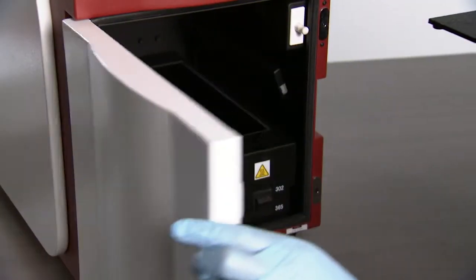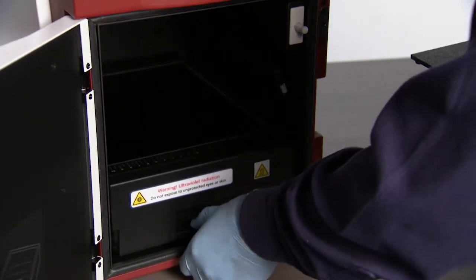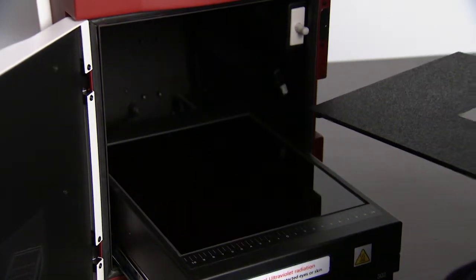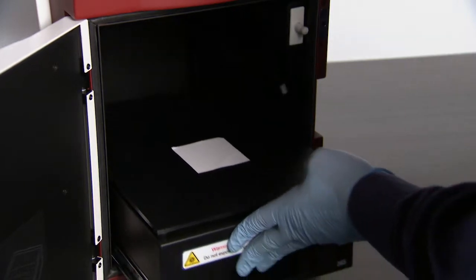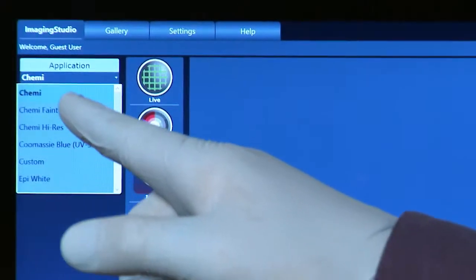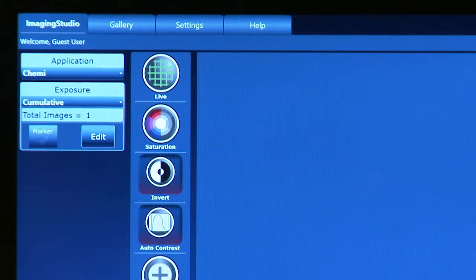To image a chemiluminescent Western blot, first place your membrane on the black tray that comes with the system and place it on the UV transilluminator inside the imager. Select Chemi from the application drop-down menu.